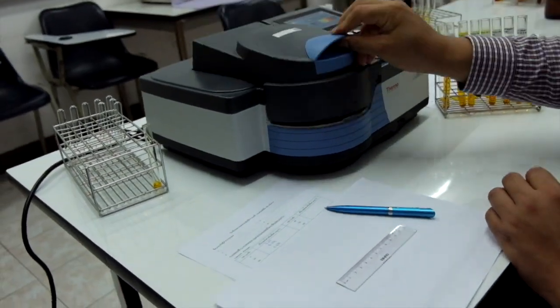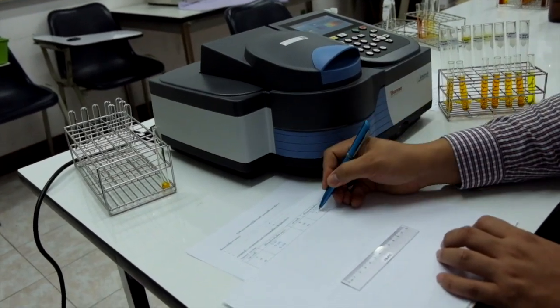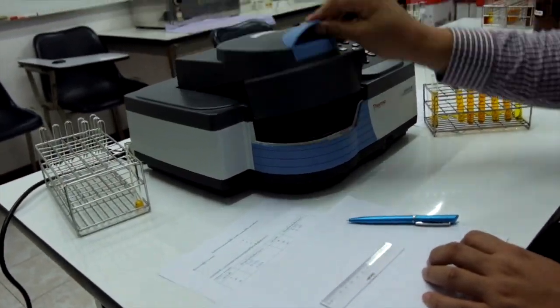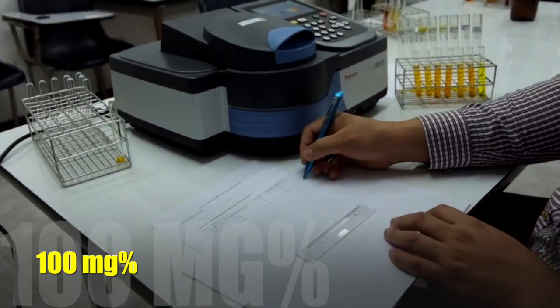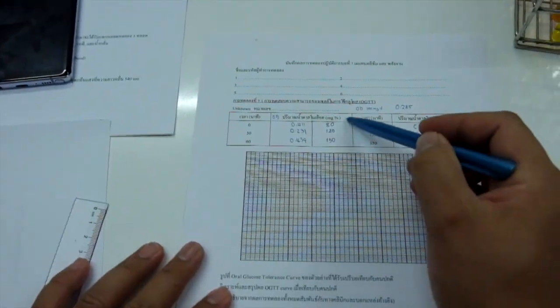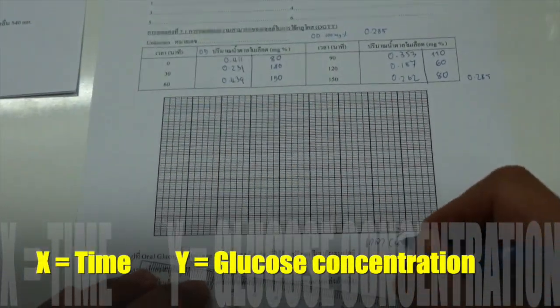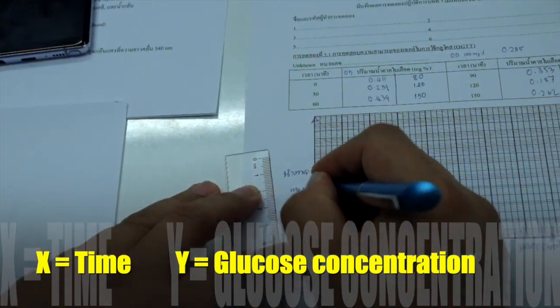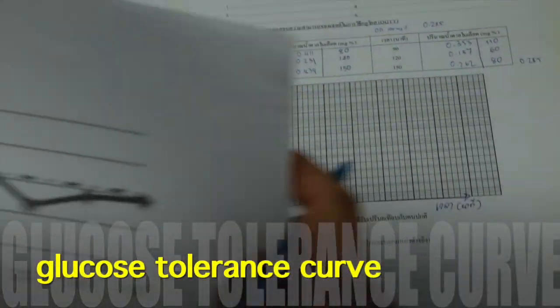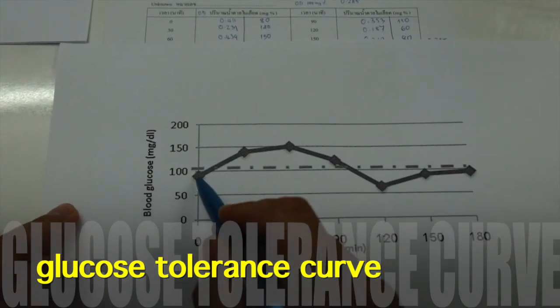Record the absorbance and calculate glucose concentration in unknown plasma collected from different time points, referring to 100 mg% standard glucose absorbance. Take a note for the calculated results. Plot the graph between time, as in x-axis, and glucose concentration, as in y-axis. You will finally get the graphs indicating glucose tolerance curve.